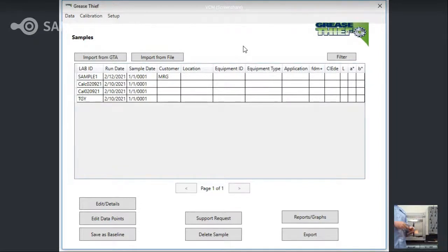And they would be able to then ensure that when they go to do their cone pen, that it would pass, saving them time from having to run multiple. They will be able to trim that down, be satisfied with the batch, and then when they run their cone penetration, they will be able to have a successful run.